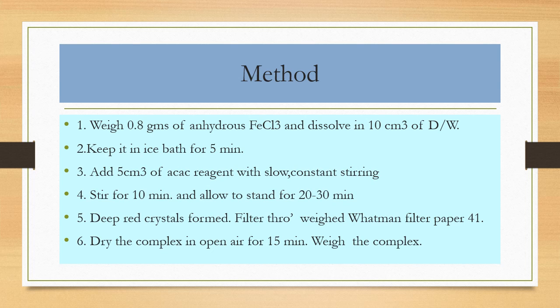The preparation is actually carried out by two methods. The employable methods are two: one uses solid FeCl3 and one uses a solution of FeCl3. If we are using solid FeCl3, one has to dissolve it in a minimum quantity of distilled water. Then the whole procedure is carried out by keeping the reaction mixture in an ice bath, because it adheres to the green chemistry principle, which requires that the reaction is carried out at low temperature, and hence the entire method is carried out at low temperature. This is the beauty of this preparation of a complex.